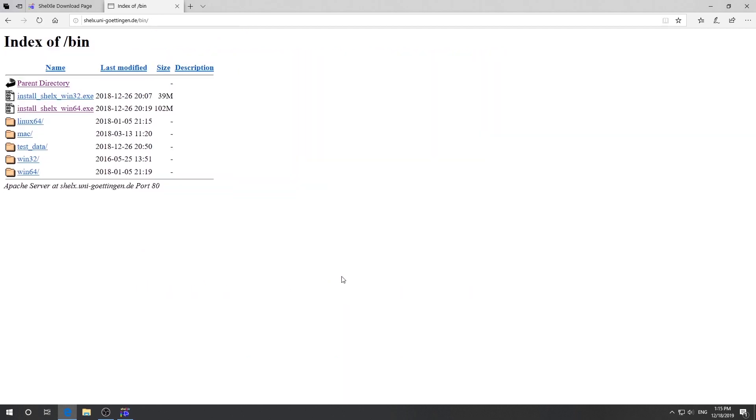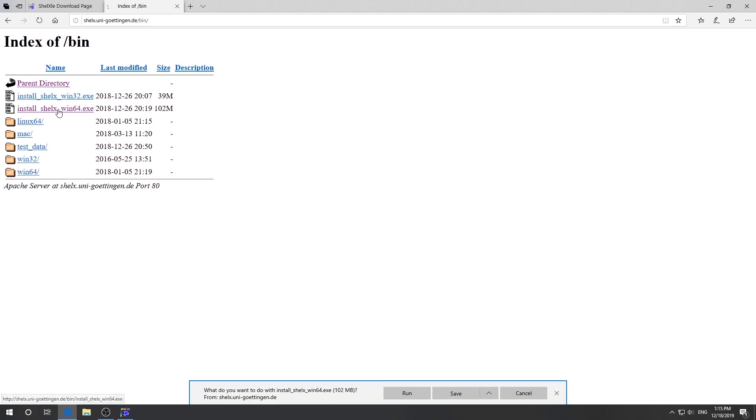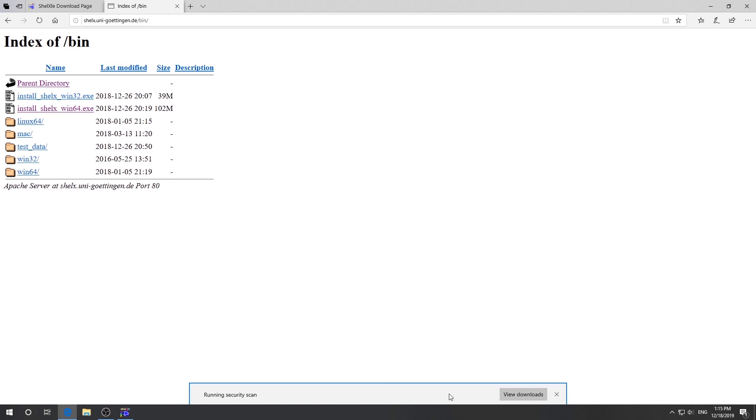Then you come to this page. Again, you need to find the one which is appropriate for your own operating system. For me, it is Windows 10 64-bit. So you just click this one to download. Then again you save first. Then you click run.